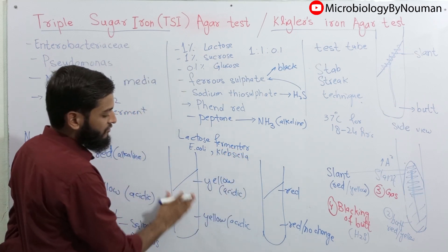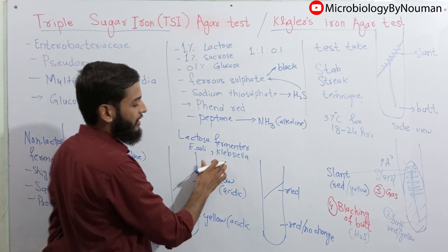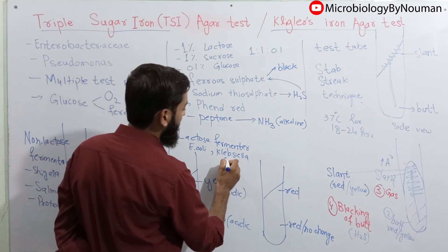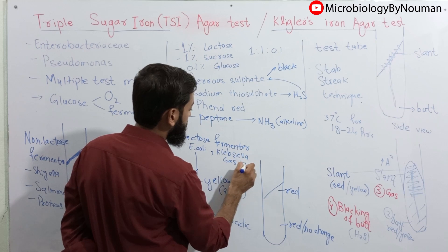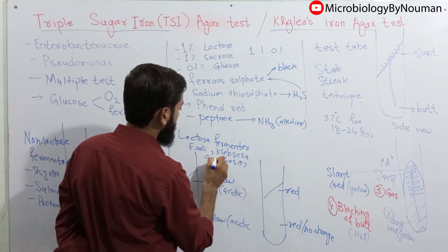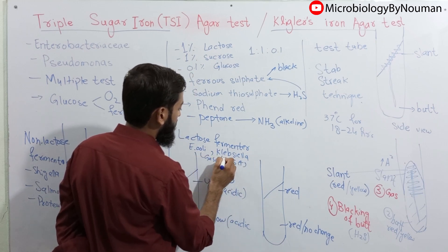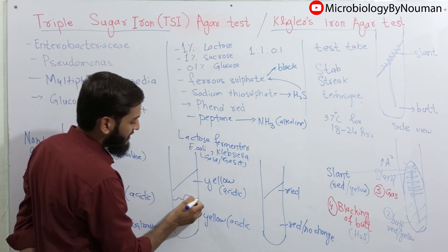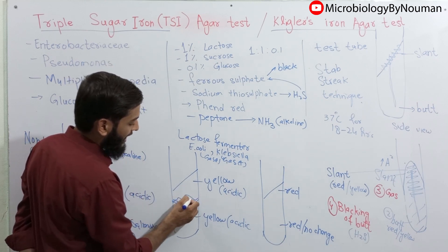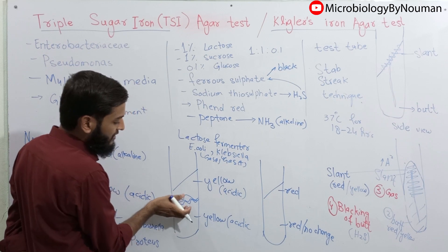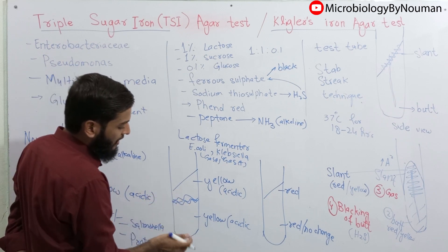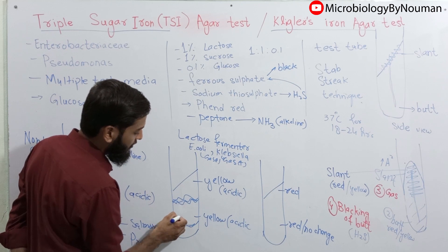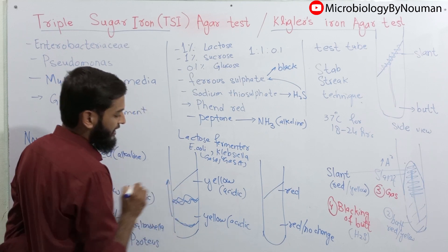Other than yellow slant and yellow butt, E. coli and Klebsiella also produce gas, so they are gas positive. The gas is seen sometimes in the form of cracks in the media, breaking it into 2-3 pieces, or sometimes the gas is trapped in the lower portion and the whole media is pushed in the upward direction.